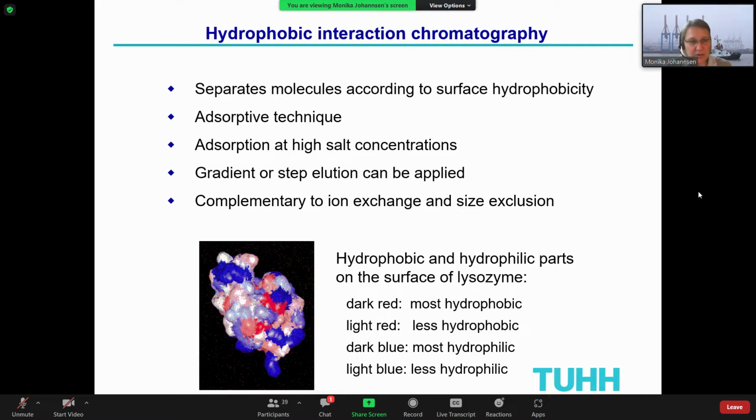So scaling is easy to avoid. We can regularly wash with water solution. For fouling, we need harsher washing steps. So it always depends. We can include a regular washing procedure after a certain time in order to enable the longer usage of the matrix, or we have to change the matrix once in a while.